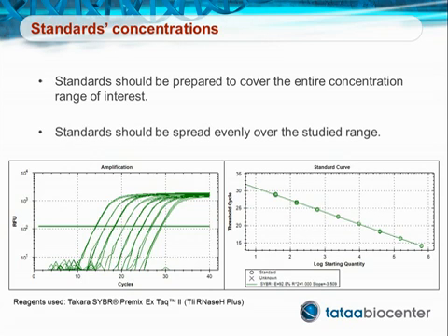First, the standard curve should always be prepared to cover the entire range of our unknowns. We should never extrapolate outside the standard curve. This is always true when using standard curves, but perhaps even more so for qPCR, since we know that at the low concentration end we will get problems with stochastic variations and possibly primer dimers, and at high enough DNA concentrations even DNA itself will inhibit PCR.